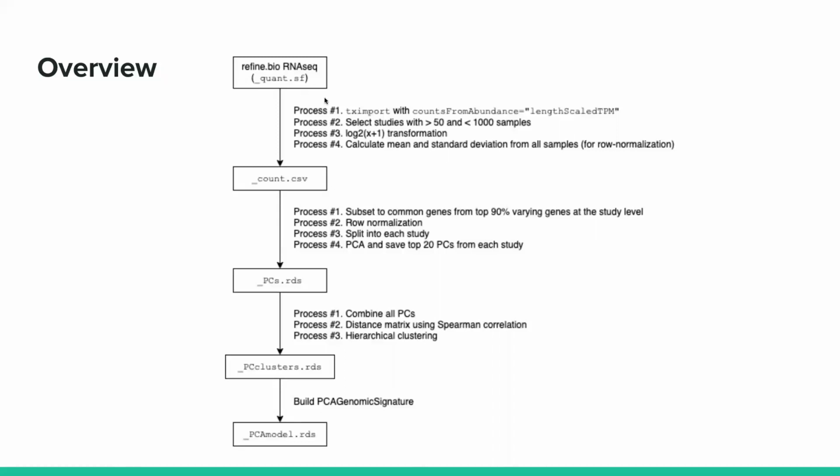I guess I won't go into detail about this, but the model building process starts with this large RNA-seq compendium, goes through some filtering and transformation steps. I should mention that Seun has done sensitivity analyses on all of these things and found the process to be quite robust to selections such as transformation and normalization.